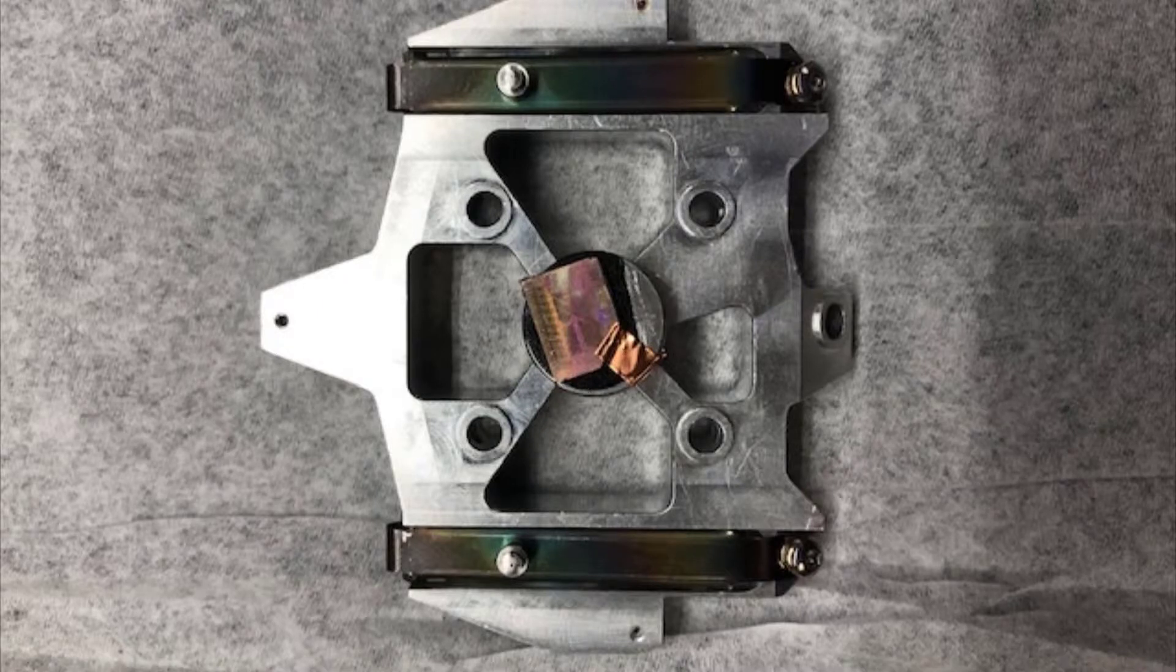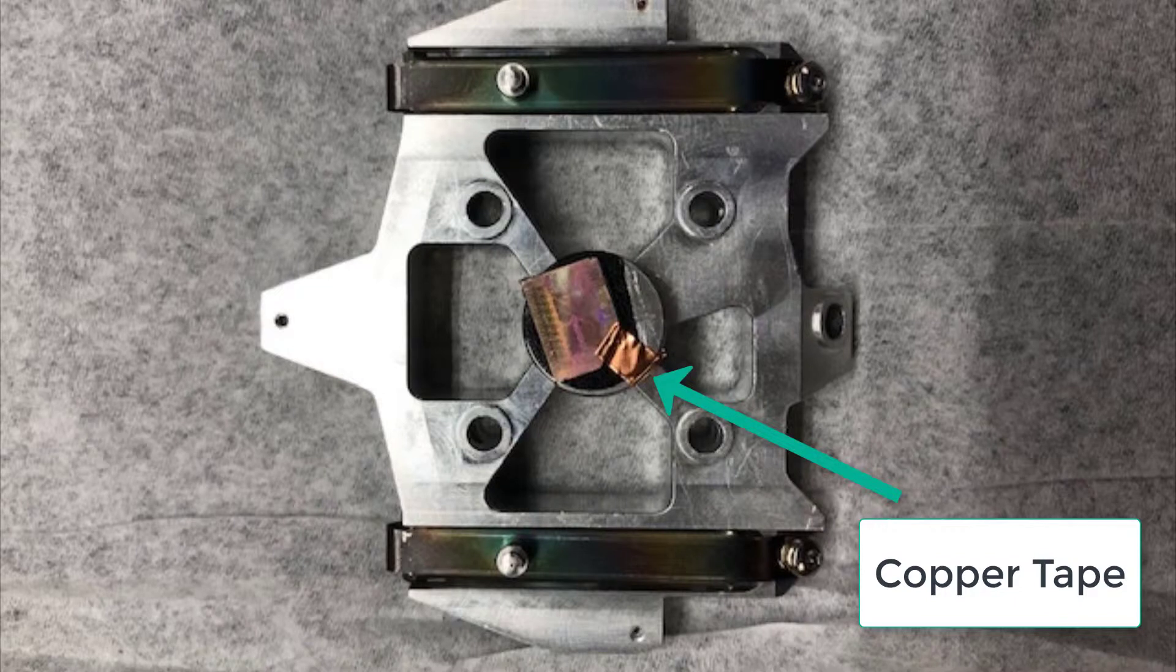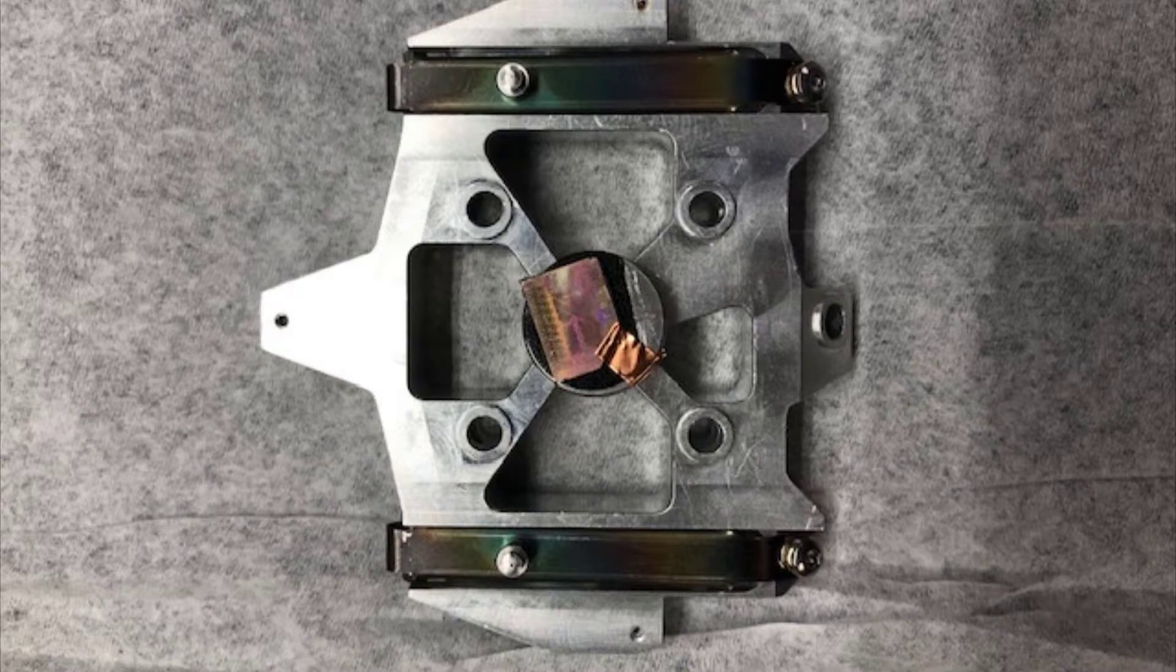Depending on the type of sample, you may wish to attach a small piece of copper tape extending from your sample to the metal stub. The tape provides a conductive path for the electrons and will minimize charging of your sample while imaging.